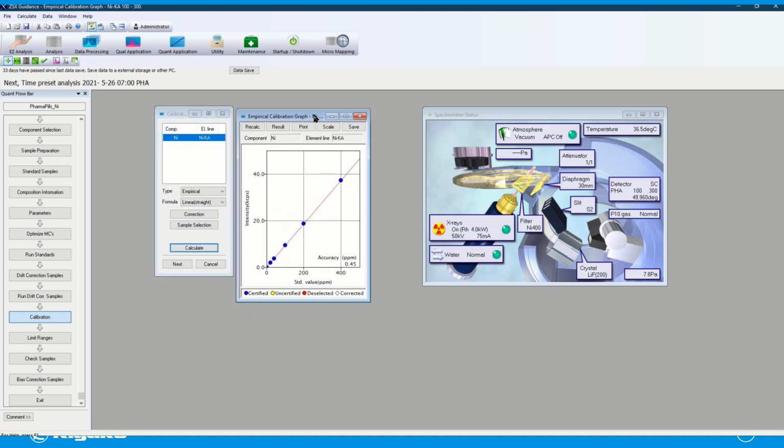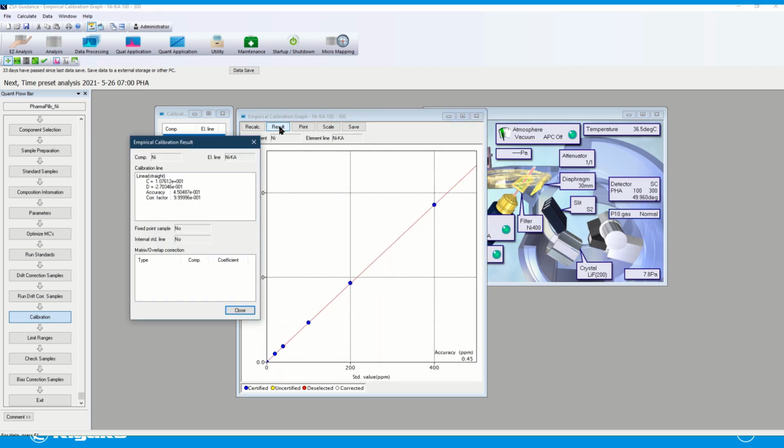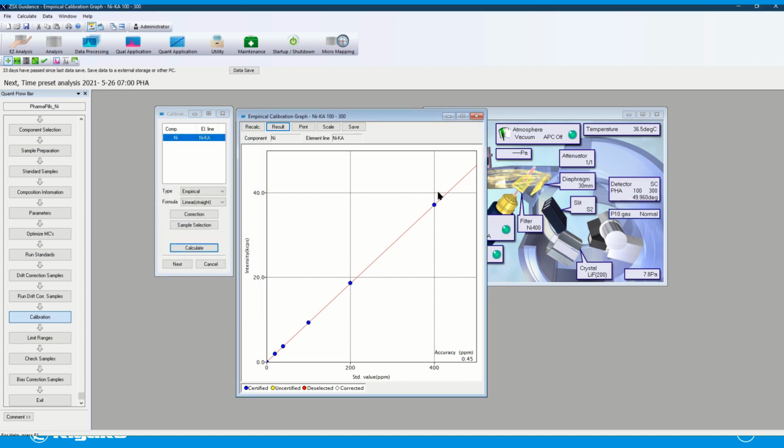It looks really good. You can drag this out. You can go in and look at your results. Here we have, actually, this is really good. I know it wasn't planned. This is a 5/9 correlation, better than 5/9. You can see that clearly. And that's with those pills just poured directly into the cup.